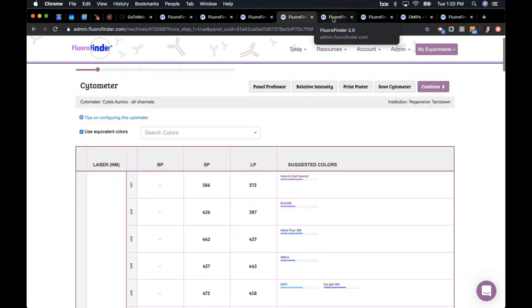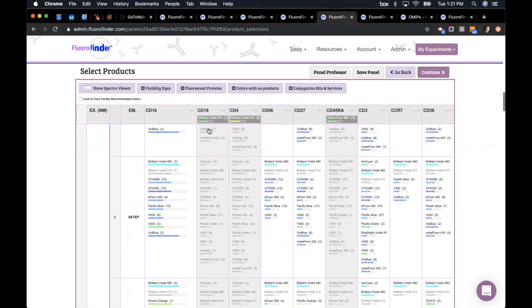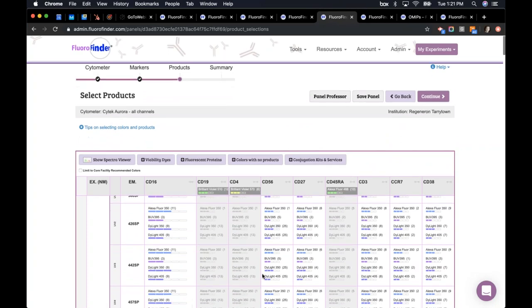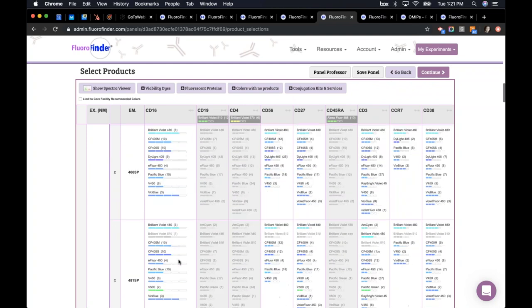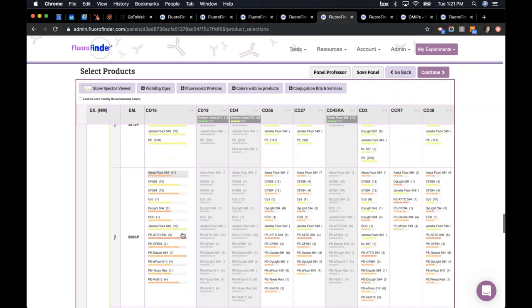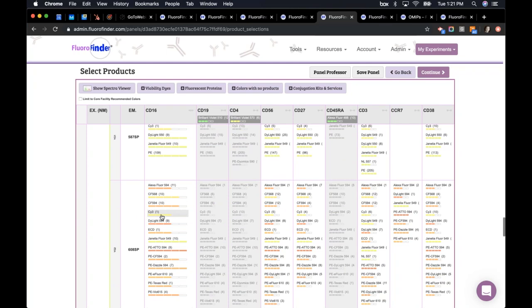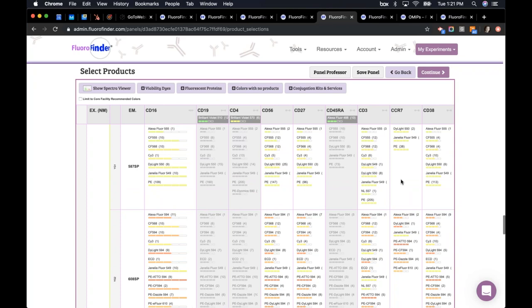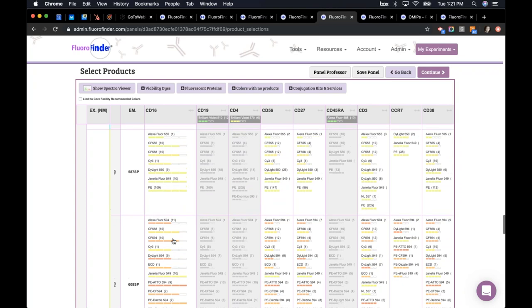Here's a products page for a spectral machine — the same Cytek Aurora. If I went back to my 561 laser and looked at Cy3, I have Cy3 in multiple channels. If I selected a Cy3 product in one channel, my other channels with Cy3 or similar fluorochromes would not be blocked out. So I'd be able to select multiple fluorochromes that are highly overlapping if using a spectral cytometer — you have the entire range of the spectra across each laser.